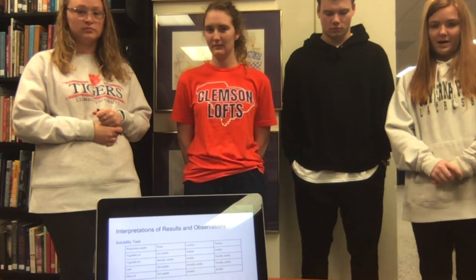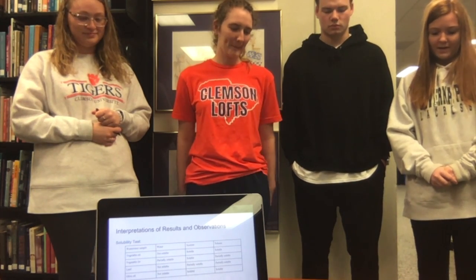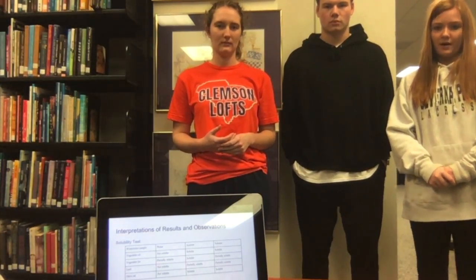So for the first test, we just tested the pH of the wastewater samples. We got that all of the samples were basic except for method 2 detergent. So that's what we got for the pH.